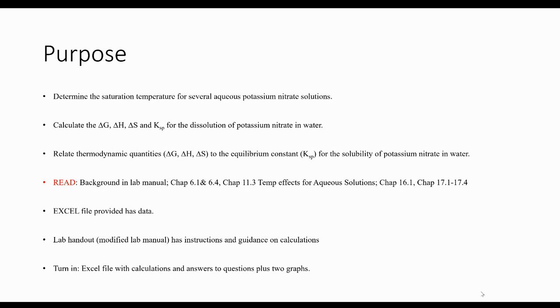There's also a lot of background within the lab manual itself, or lab manual handout itself. So I would take a look at all those different sections before you begin the lab, because I think that it will just be helpful to understand the key terms. The main purpose is going to be to relate KSP to thermodynamic values of free energy, enthalpy, and entropy.